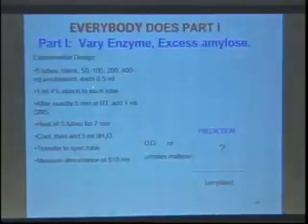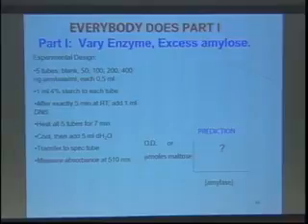5 tubes, 4% starch in each tube. React for 5 minutes at room temperature. The way you stop it is add 1 ml DNS. You have to heat all the tubes, including the blank. Why would you have to heat the blank? No reaction occurred to produce the maltose, right? Because you need to have the DNS react with the background, right? And that only happens at high temperatures. So you have to heat it, okay? Then cool it and measure it.